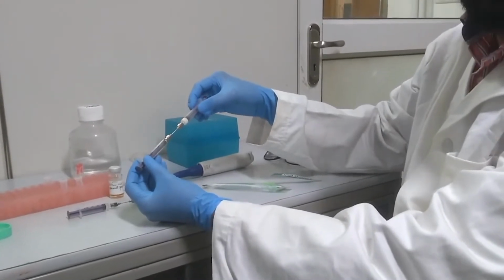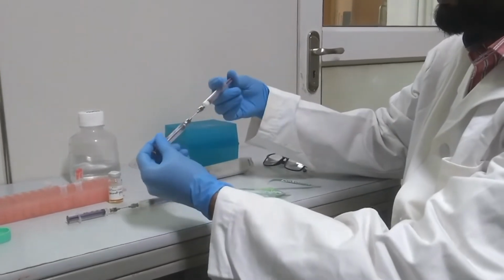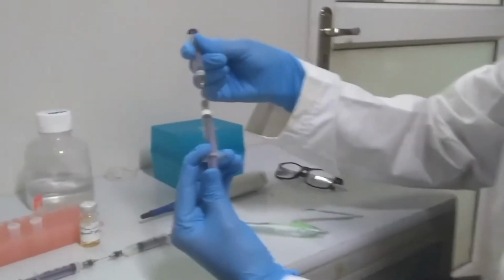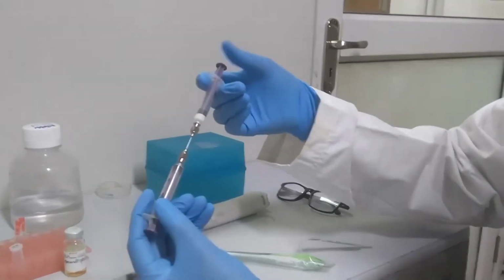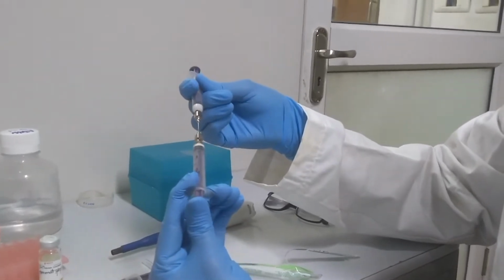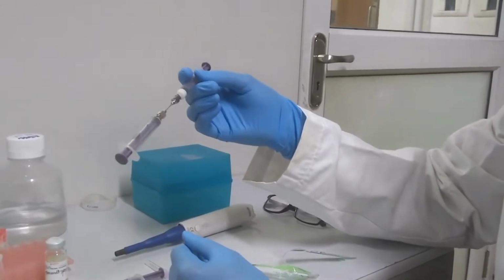Initially it was two phase, and then slowly it has turned into single phase. Now you can push this emulsion from one syringe to another syringe. This process creates a very good emulsion, which doesn't separate out later on when you are ready to inject.